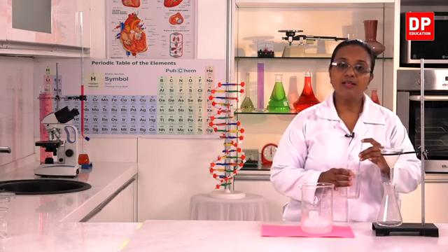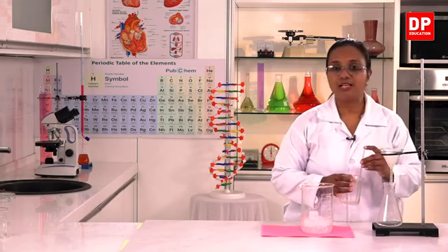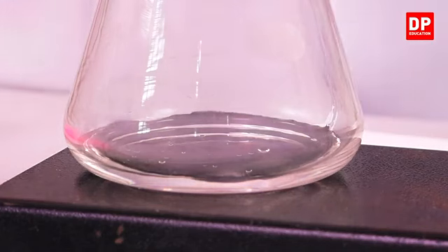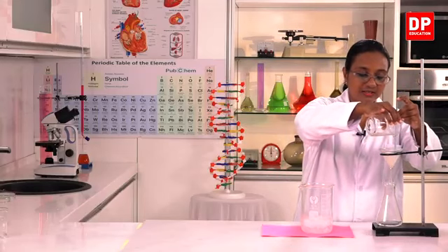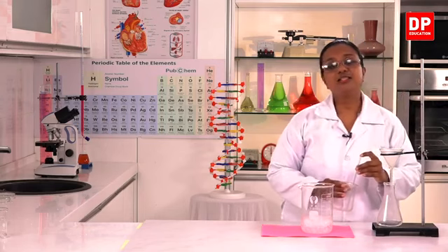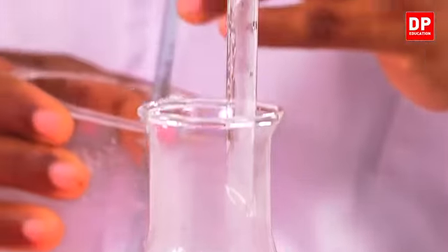Then all the particles that can go through the pore size of the filter paper will get filtered. We will collect the filtrate inside the conical flask. Once we do that, we have to place the conical flask inside the beaker containing ice so that the solution will cool and the crystals will form again.